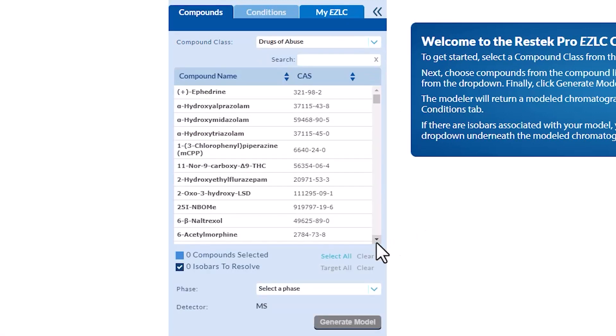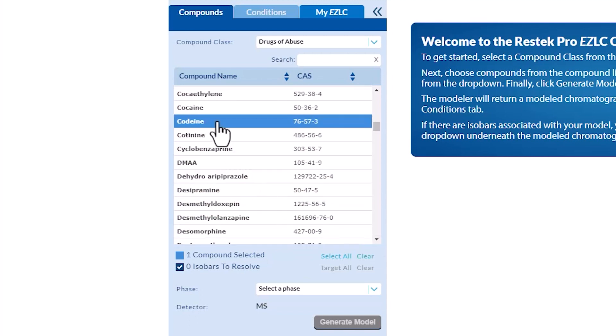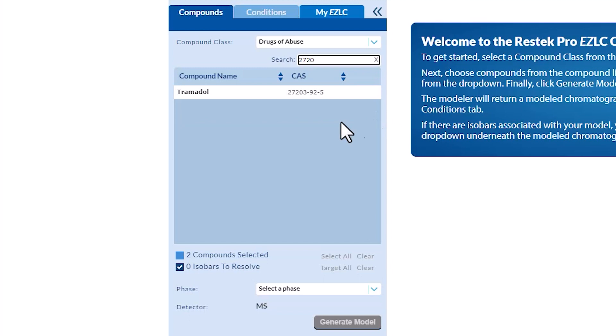You can select your specific compounds of interest by scrolling through the table and clicking on them. The compound row will turn blue when selected and can be unselected by clicking again. You can also use the search box above the table to find compounds by typing their name or CAS number.